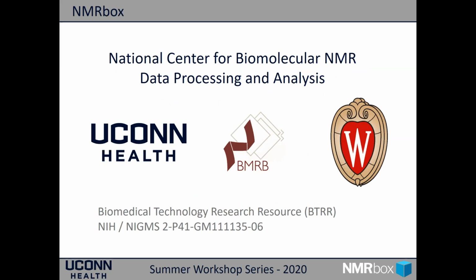NMRbox is a P41 National Center for Biomolecular NMR Data Processing and Analysis. It's a collaboration between the University of Connecticut, UConn Health, University of Wisconsin, and the BMRB.